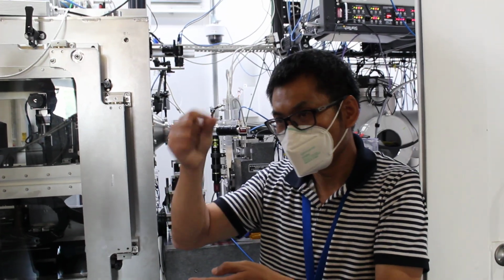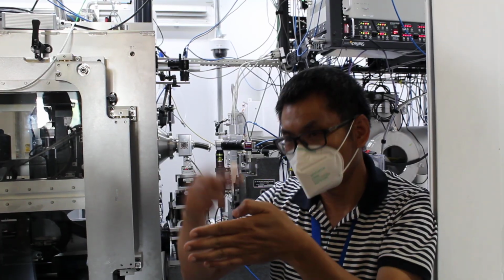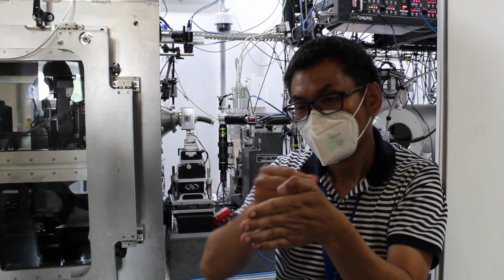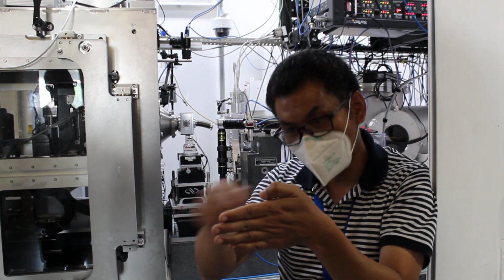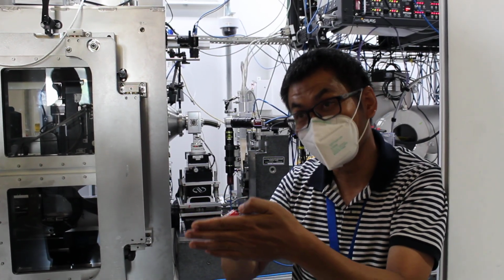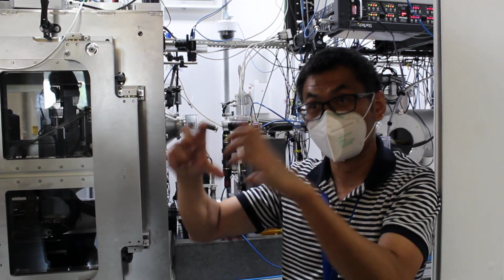So basically, what you do is take a small beam. This is very much like a lot of the imaging experiments done on other beamlines. You take a small probe and scan across the sample, so every step you basically do a small experiment. By looking at how you see things differently on the detector at each point, you put that information back together, and now you get a map of what you're scanning.